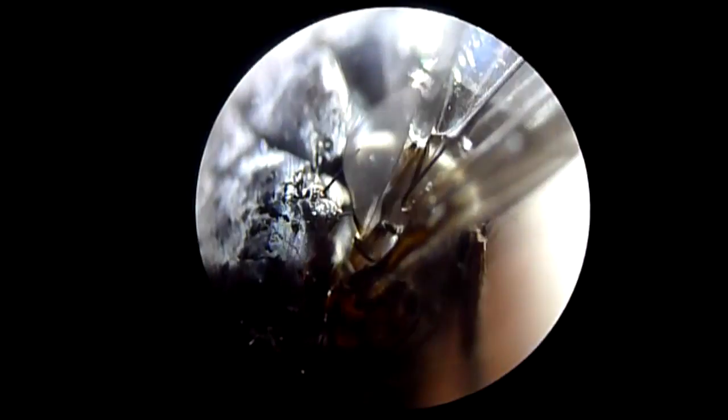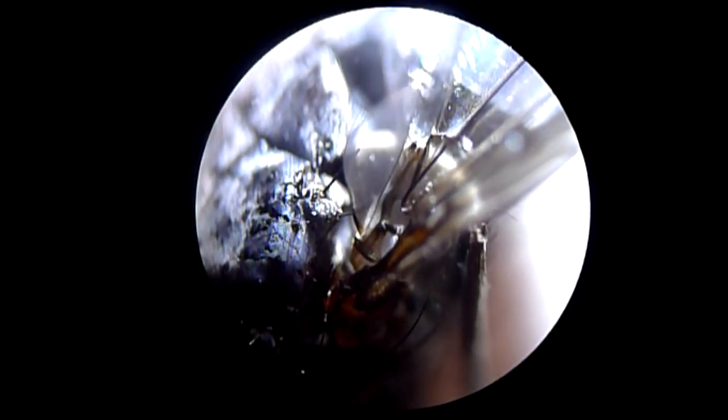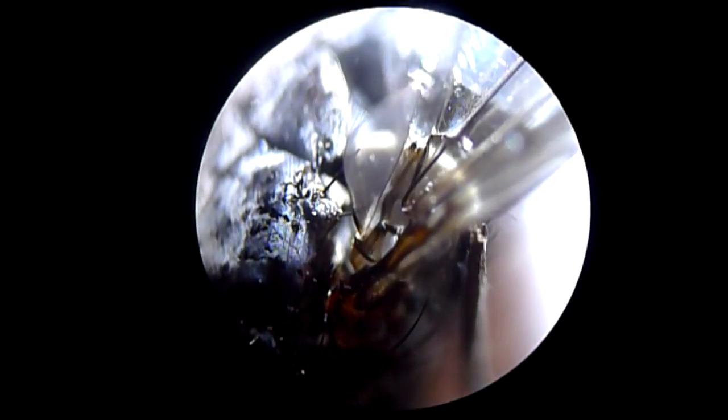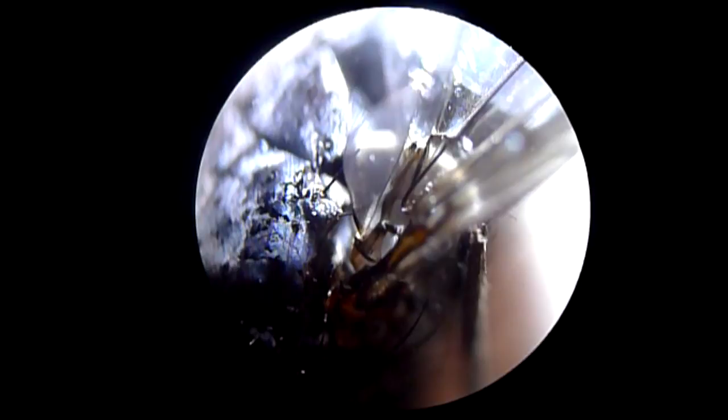Okay, last little subject is a very old, very dry, dead fly I found on the floor. Actually, I killed it ages ago but kept it for a while. This little hobby gets you keeping everything that you find, every little tiny thing. This is at a 40x magnification with a 4x objective, 10x eyepiece.